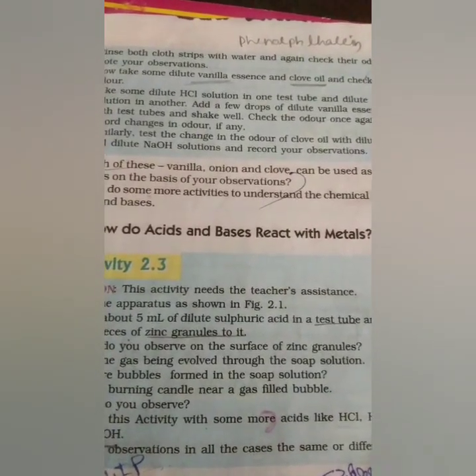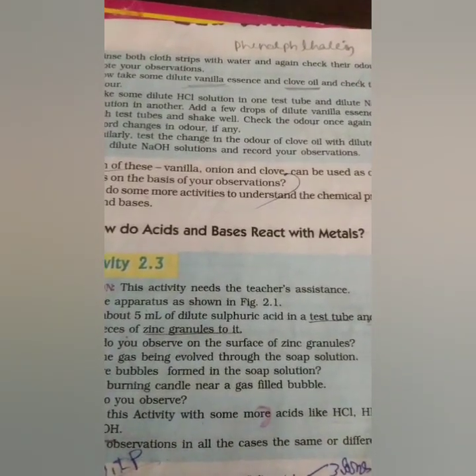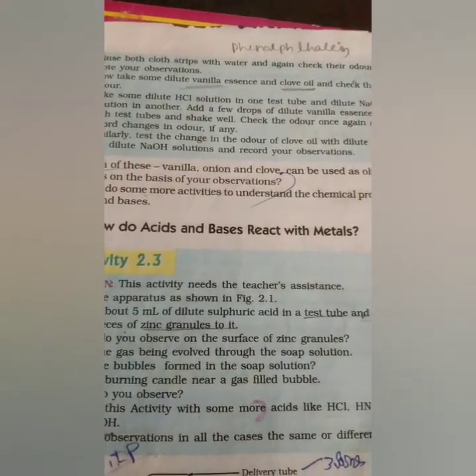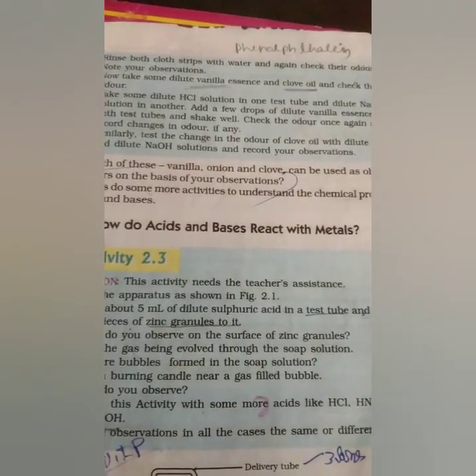But when we take one more cloth strip and add a little quantity of NaOH on that cloth strip, what happens? The smell of onion is lost from that particular cloth.